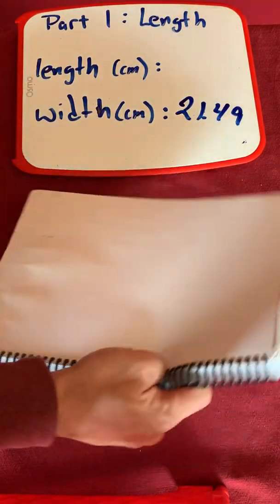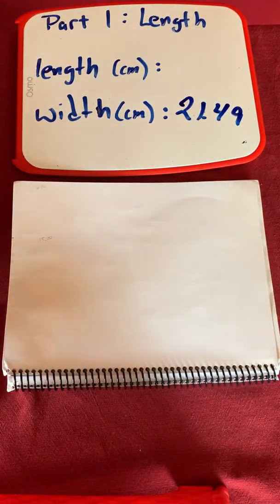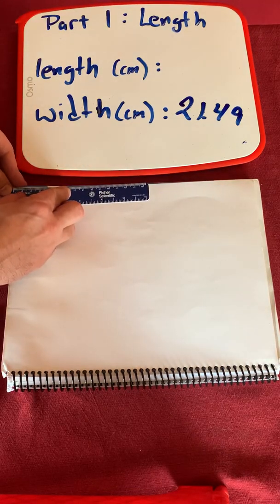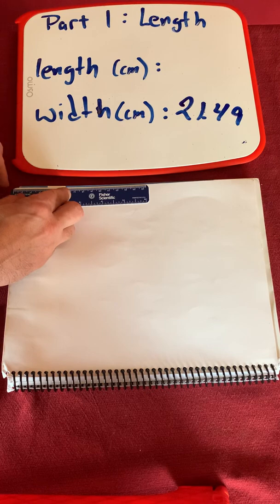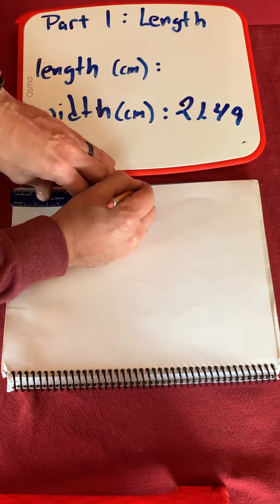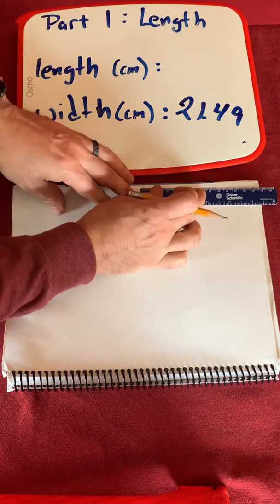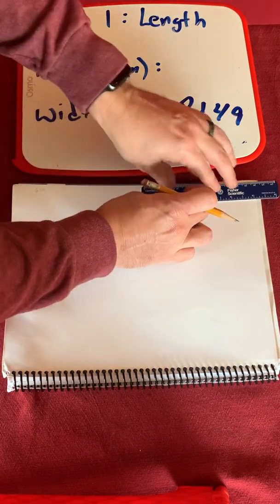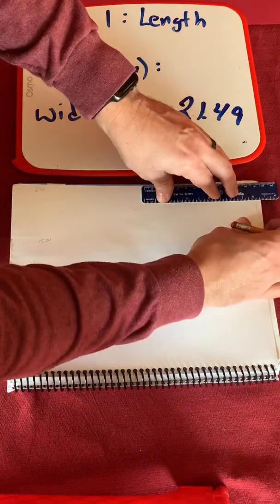We're going to rotate this and do the same thing with our length. All right, so again, I've got my zero point on my ruler there. I'm going to mark where the 15 hits. I'm going to shift my ruler over, and I'm going to see where the edge of my paper falls.